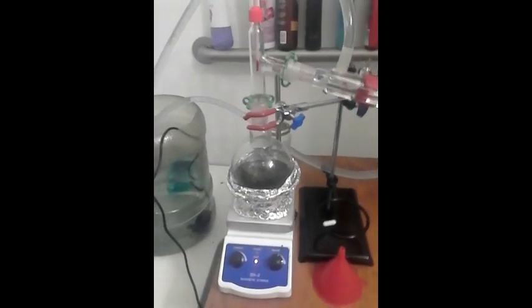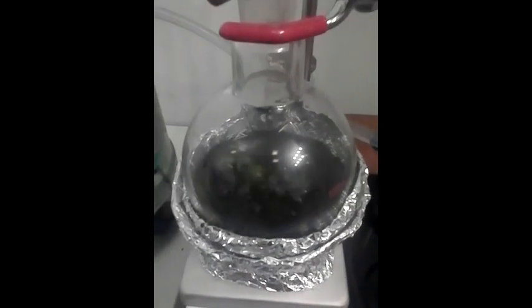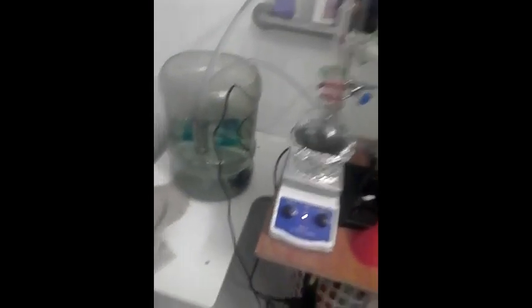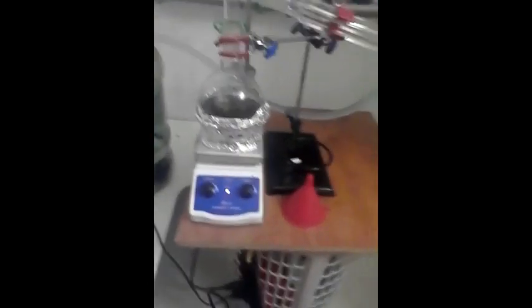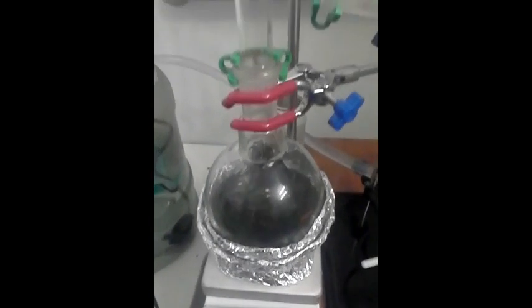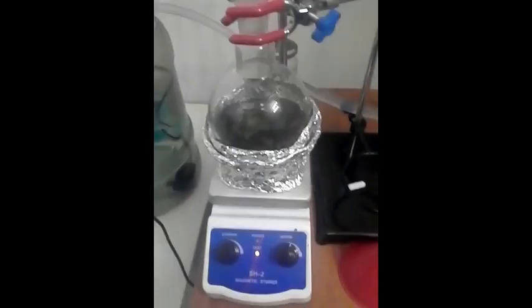I am on, I think, the third and final step of this process. Everything is coming along fine — it's going up into the condenser. Temperature is exactly where it needs to be, and that's coming over clear, which is exactly what we want. So all the stuff we want is in there, and the solvent's coming over to there — I'm in the solvent recovery process. Next is going to be getting what's left in here evaporated off, and the only thing that's going to be left is the essential oil. It's been about seven hours so far.